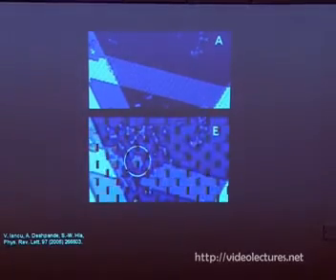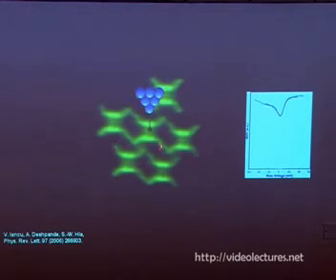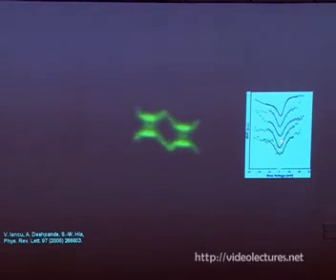Okay, so this is a ribbon. We created a hexagonal unit from the ribbon by tip, and these are the 7 molecules. We measure the Kondo temperature at the center molecule, where the Kondo dip appears at the Fermi level. Then we remove one molecule from the edge and measure again. We see the Kondo effect slightly wider now. We keep doing that, measuring at the center, and at each step the Kondo signature is wider and wider.